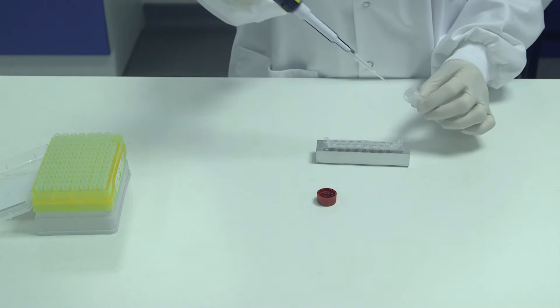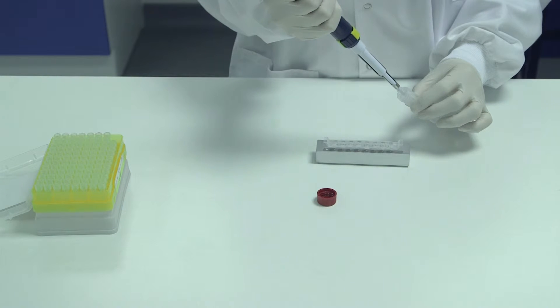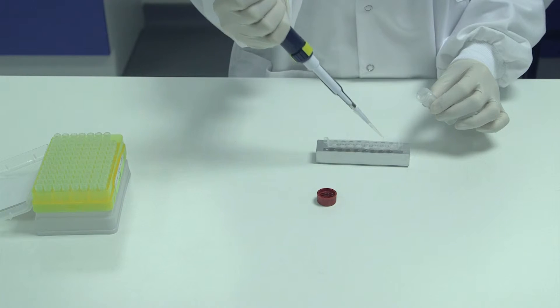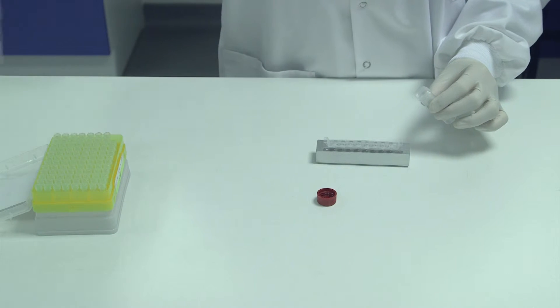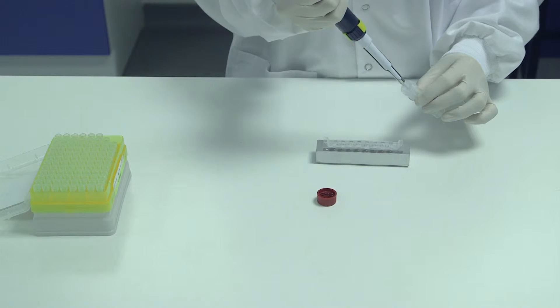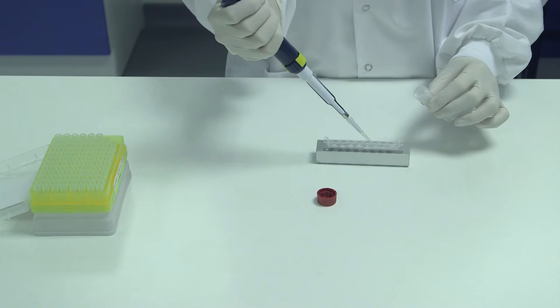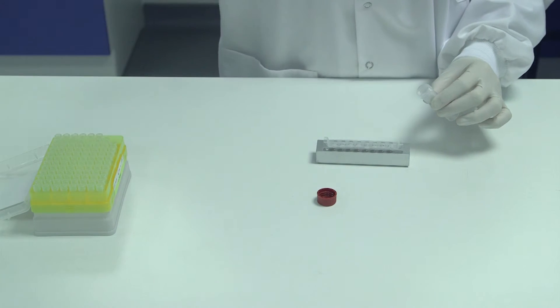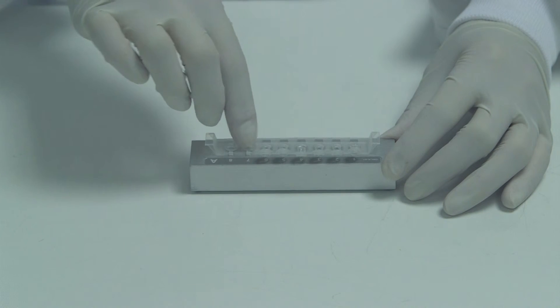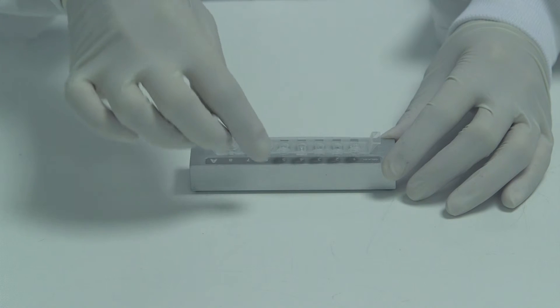Pipette the extracted meat sample into the Genie strip, taking care to change the pipette tip each time. Once finished, cap the strips and place into the Genie instrument and press start.